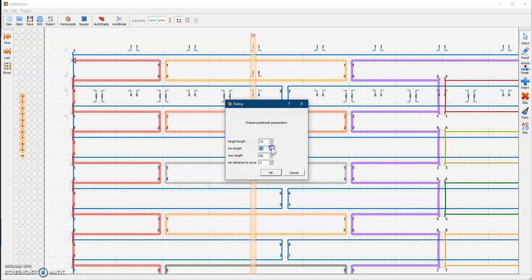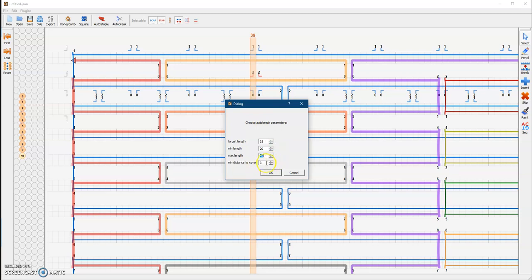Your minimum length should be 20 — no less than 20. Your staple strand should be no less than 20, and no more than 40 for the max. So we're going to change that right there. The distance between crossovers tells you, if your shape gets more intricate and has different parts where things cross over, how many distances you want for your crossovers. You don't want your crossovers too close because that will make your shape unstable, so be reasonable — the more the better. A distance of 3 here will not harm us because we only have a few sets of crossovers in the center. Hit okay.